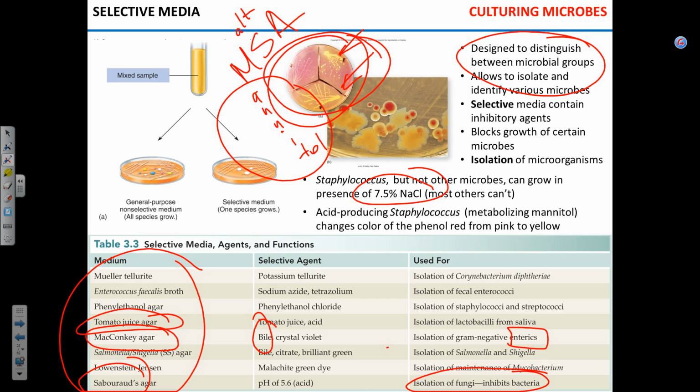Now, one thing I want you to keep in mind: in microbiology, one of the things that sometimes confuses students is that the rules, the laws, like smaller laws, are often stretchable and fuzzy. When we say Sabouraud agar inhibits bacterial growth, it doesn't mean that bacteria are not going to grow on it. It means that they're going to grow slowly.